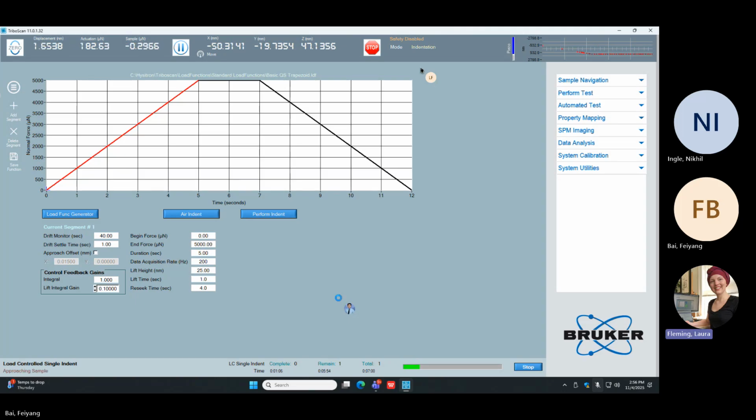Once it reaches the safety height, you can see the piezo extends, but you need to look for that. Well, the tip looks for that sample surface. This is coming down one click at a time. Piezo's looking, tells us what it's doing down here. So approaching sample, it found the sample, and now we're starting with that 60 seconds of motor settle time.